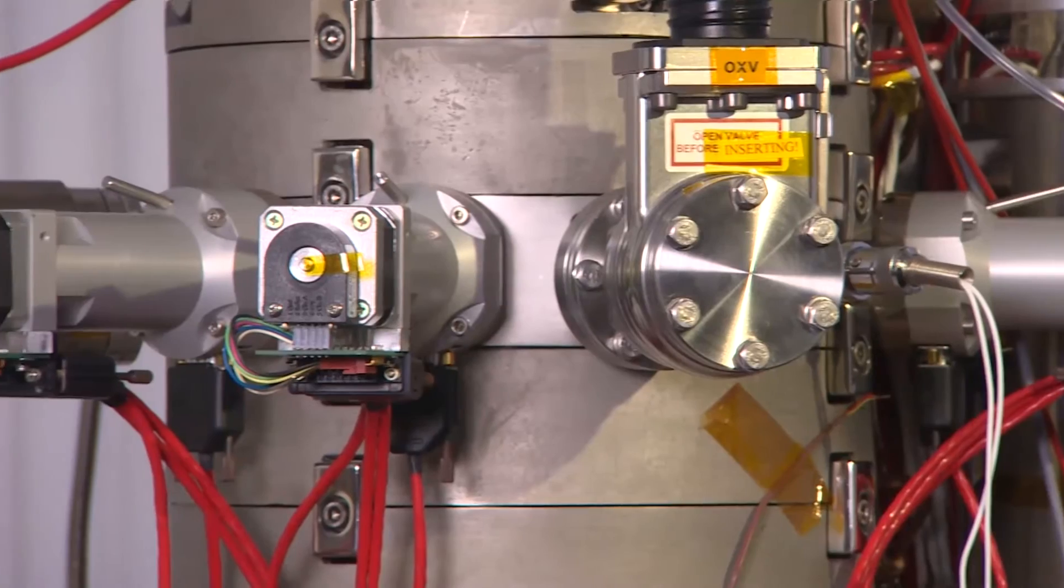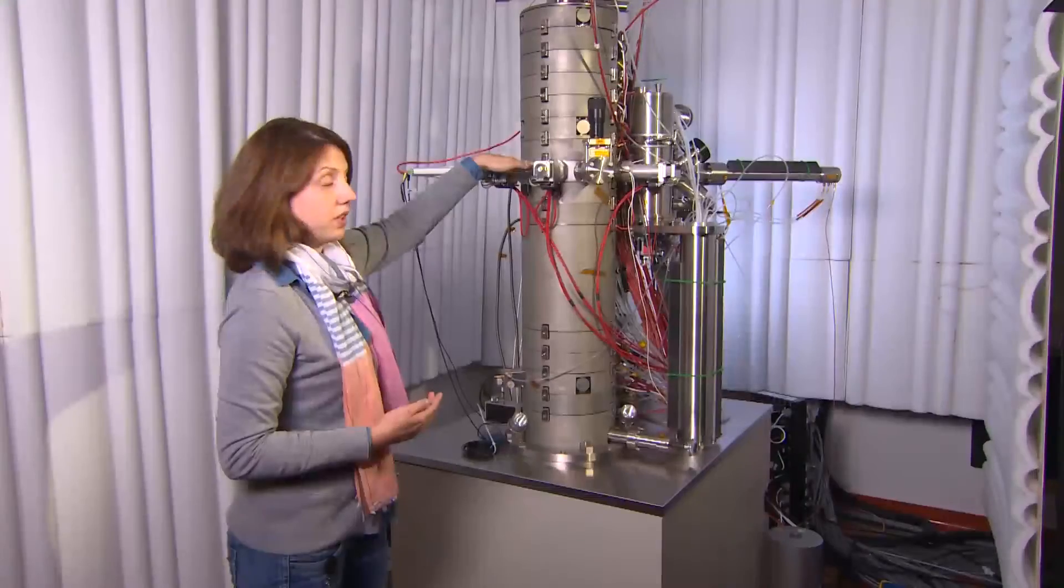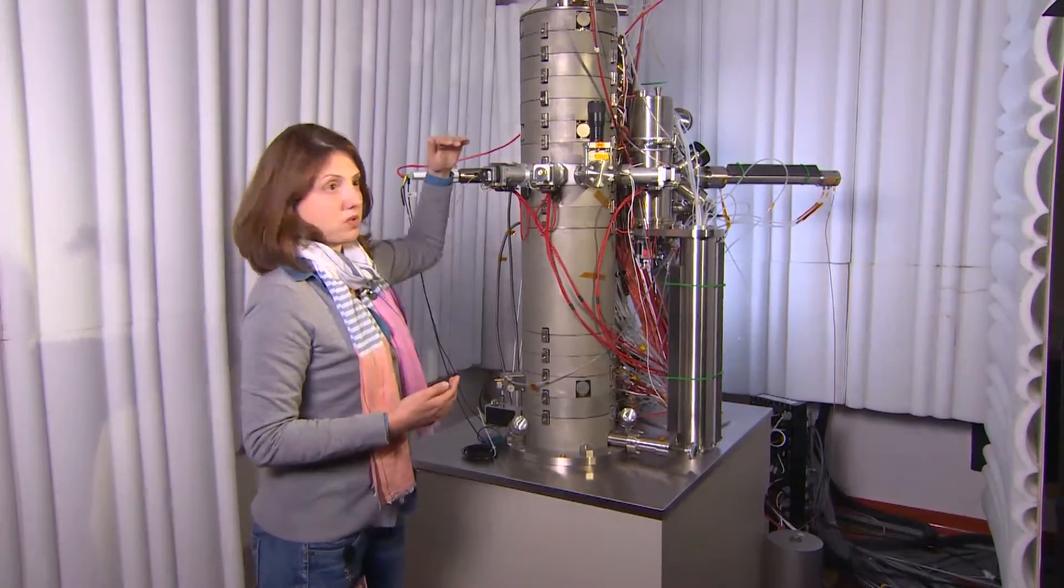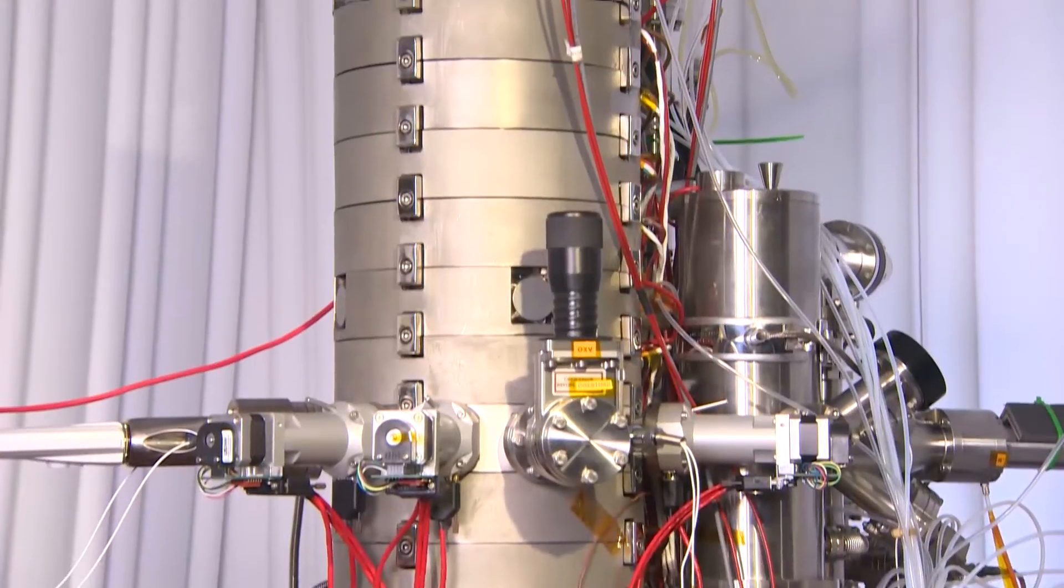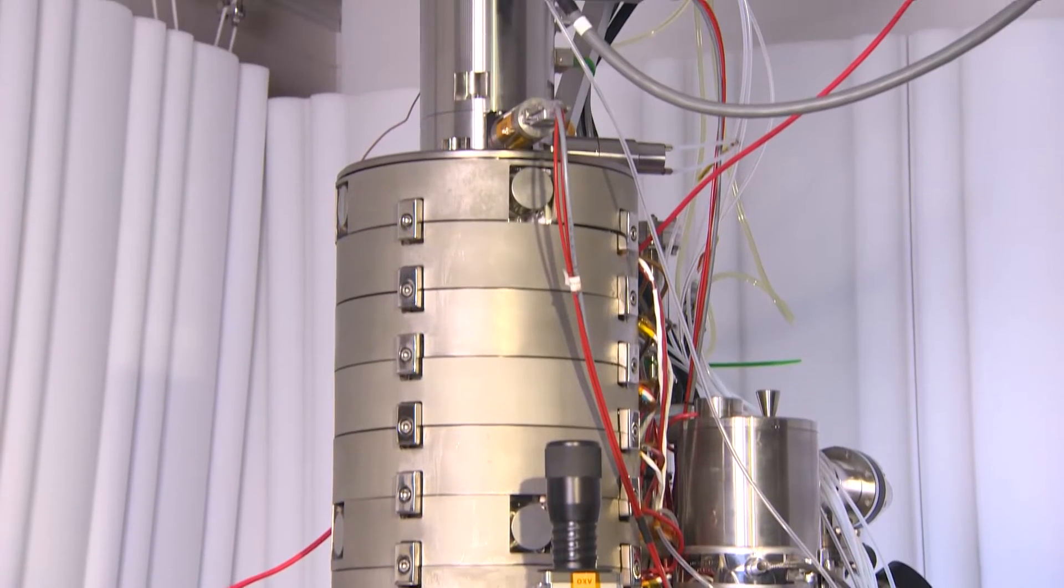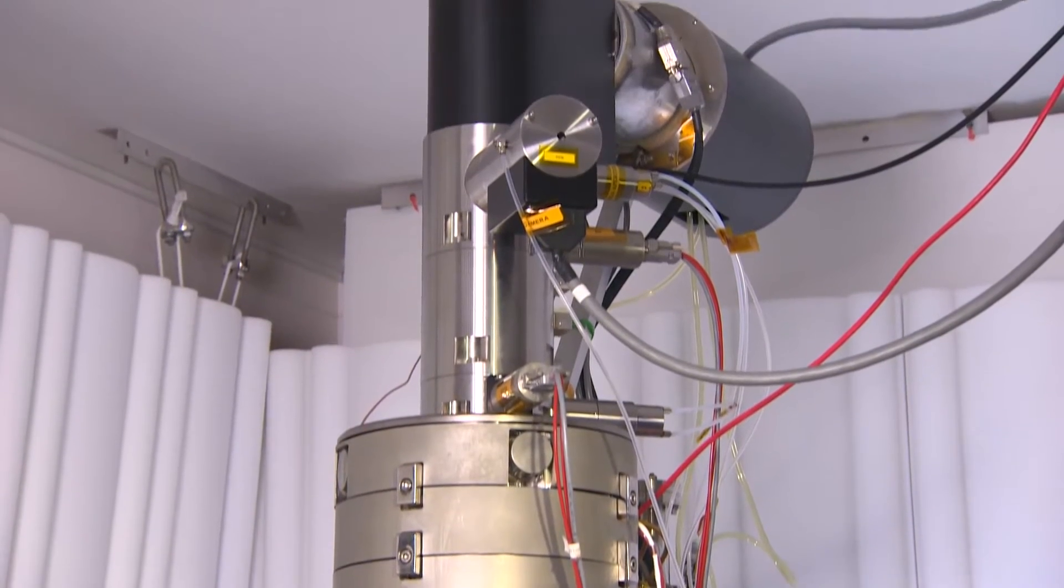The sample itself sits at this level here. The electrons will go through the sample, it's a transmission microscope, and through another set of lenses will be directed to the detector tree. The detectors will collect electrons and form the images.